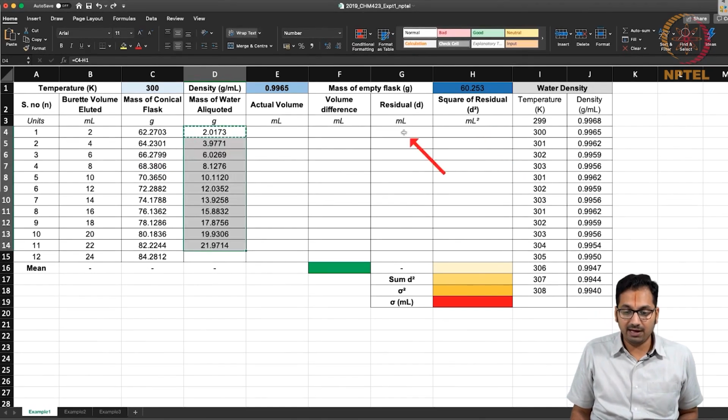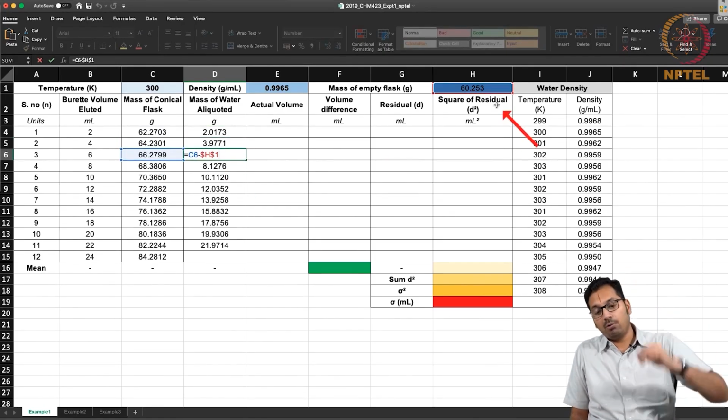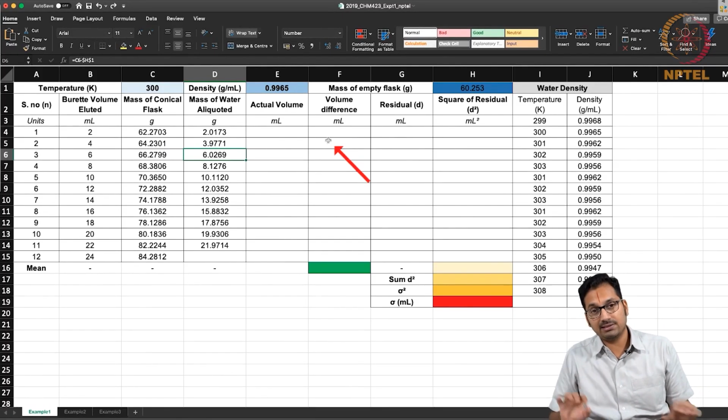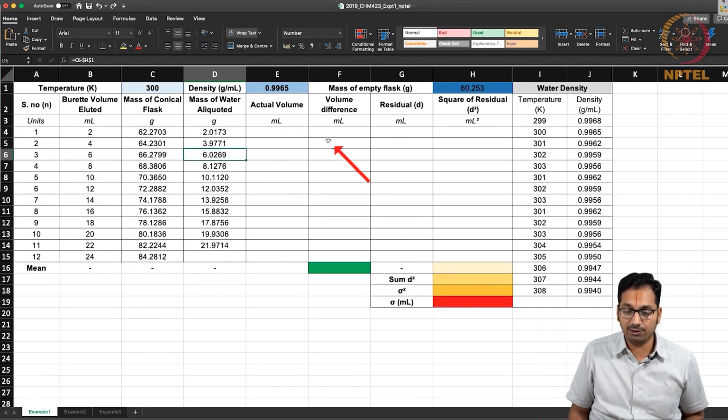So one has to be very careful where you include this dollar, such that for every value you end up measuring, the dollar one does not move at all. So this helps you understand how to use spreadsheets to make differences across different cells, keeping one cell constant while the other cell increments based on the value that you want to measure.